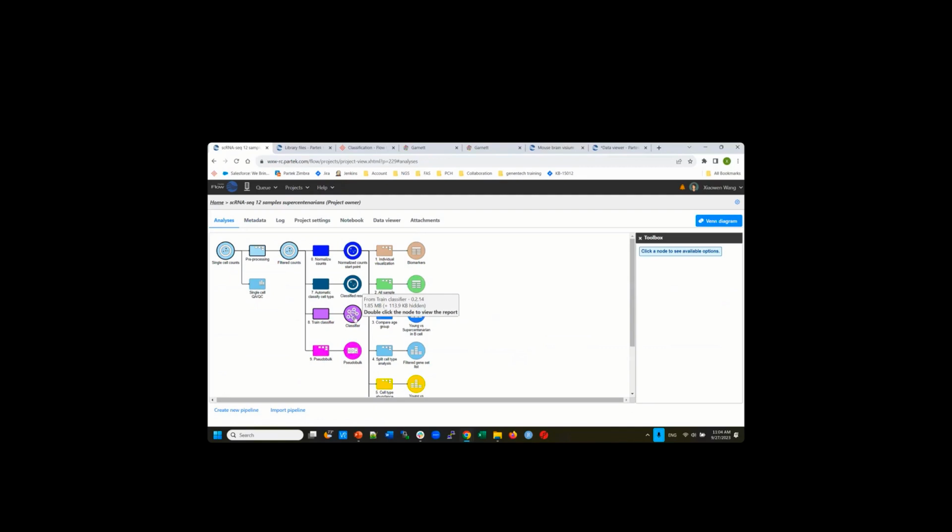If you want this annotation to be seen by all the different data nodes, you click on this data node and choose publish classifier. My internet is really slow, so it takes some time to pull up.